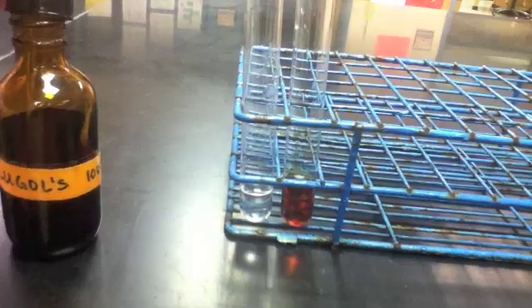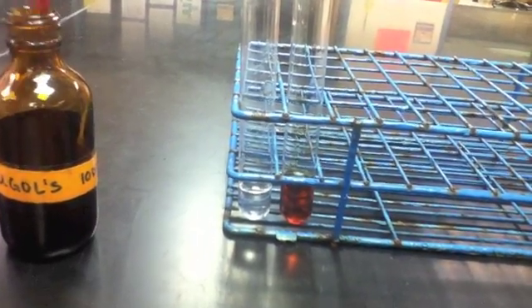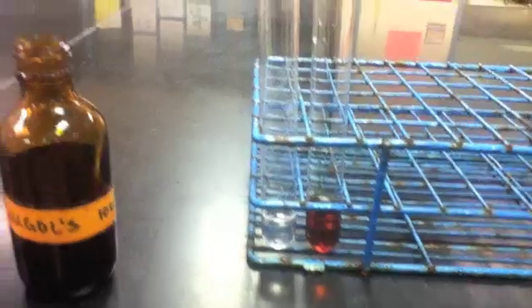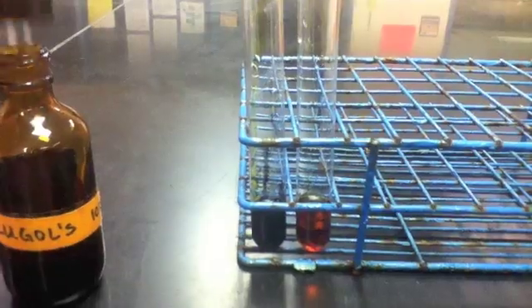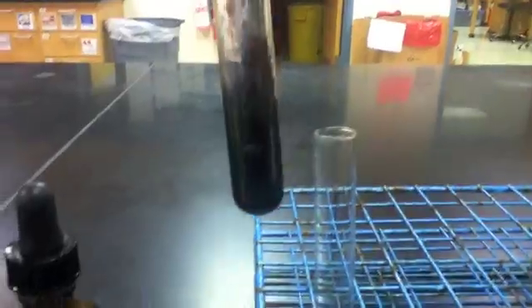I'll now add iodine to the positive control tube, which contains starch. Notice that immediately there's a color change to the bluish-black previously described. As I agitate the tube, you can see the precipitate forming on the walls.